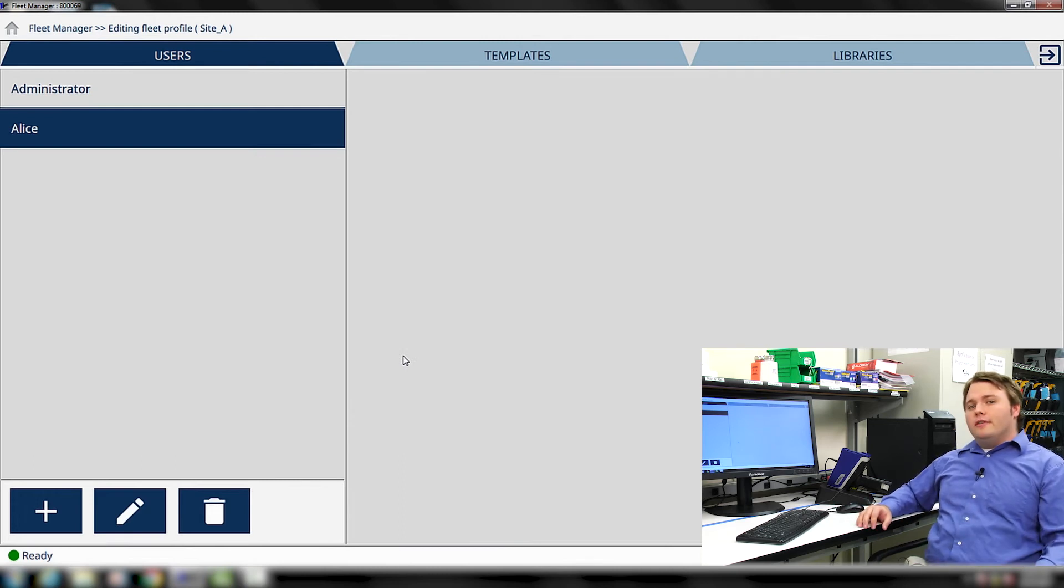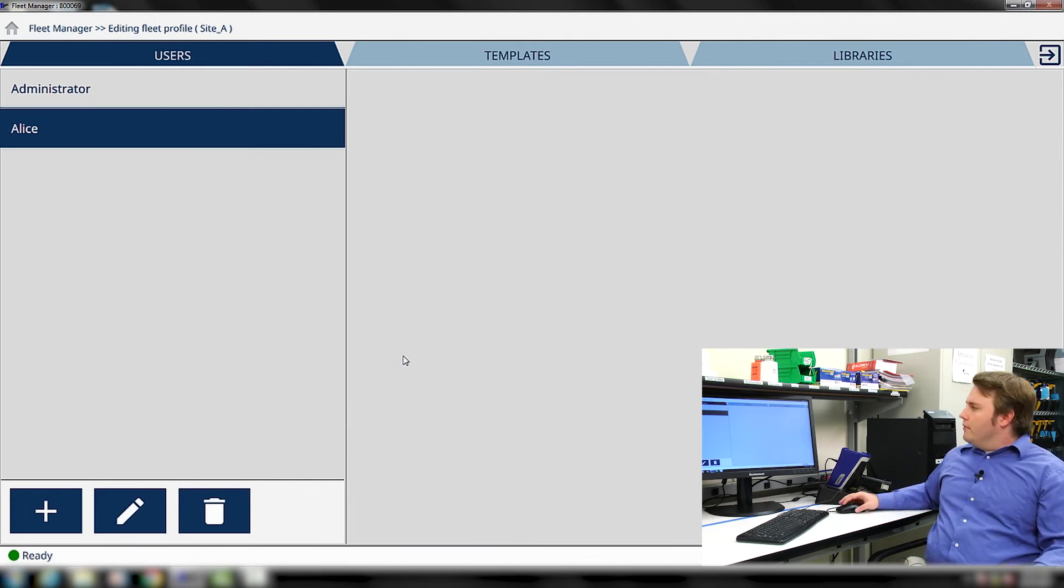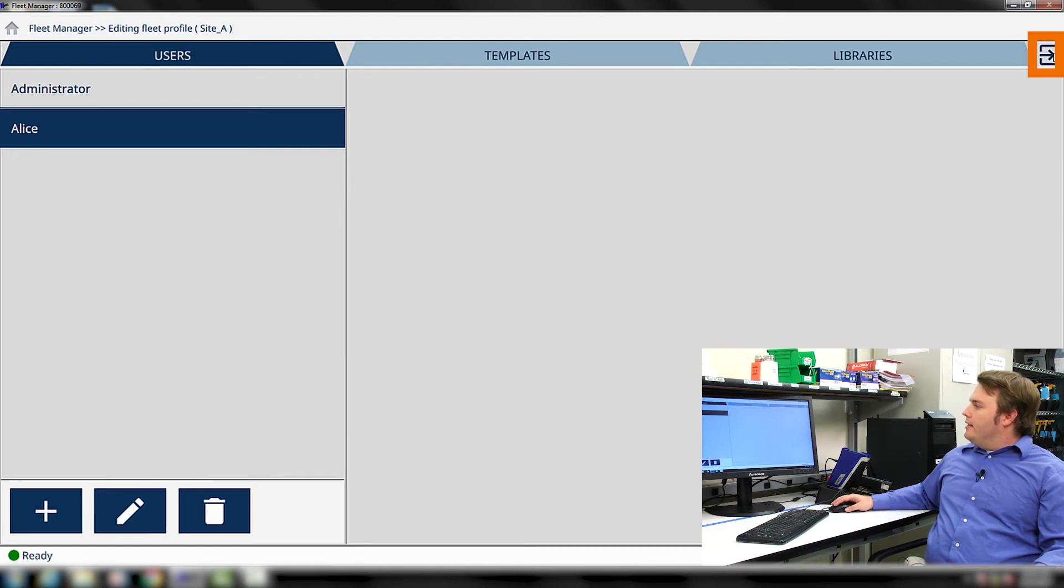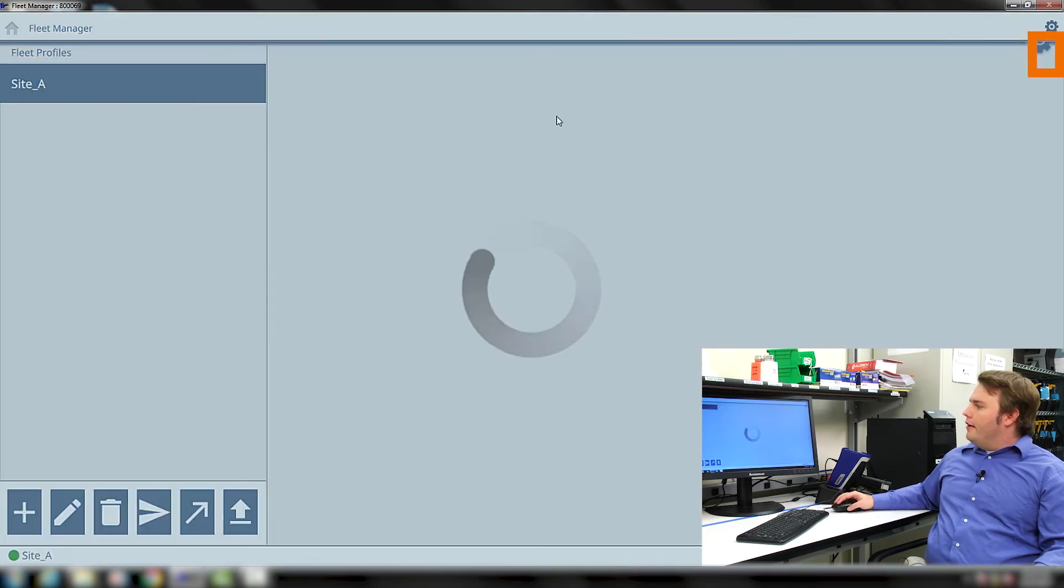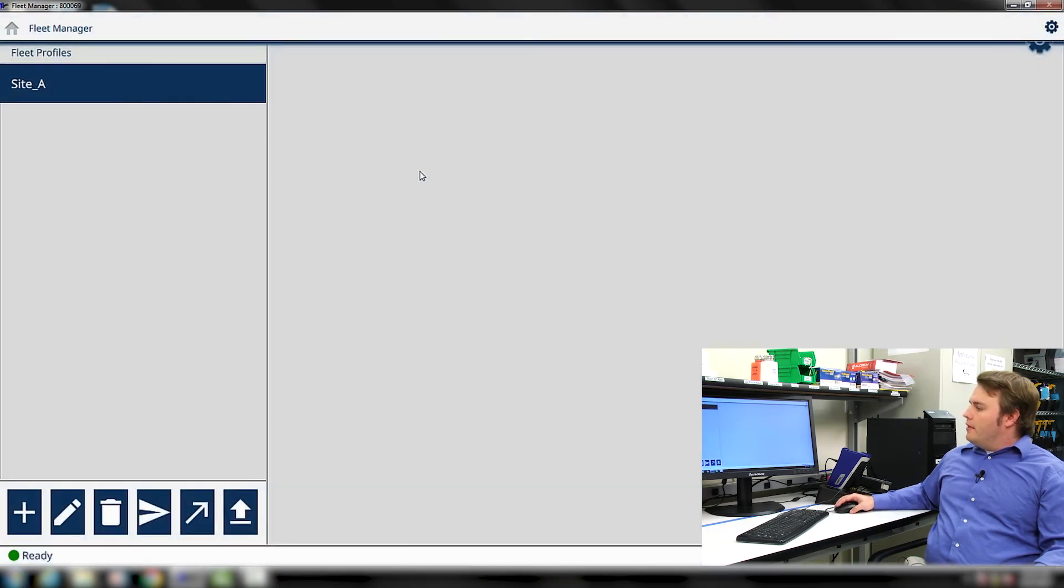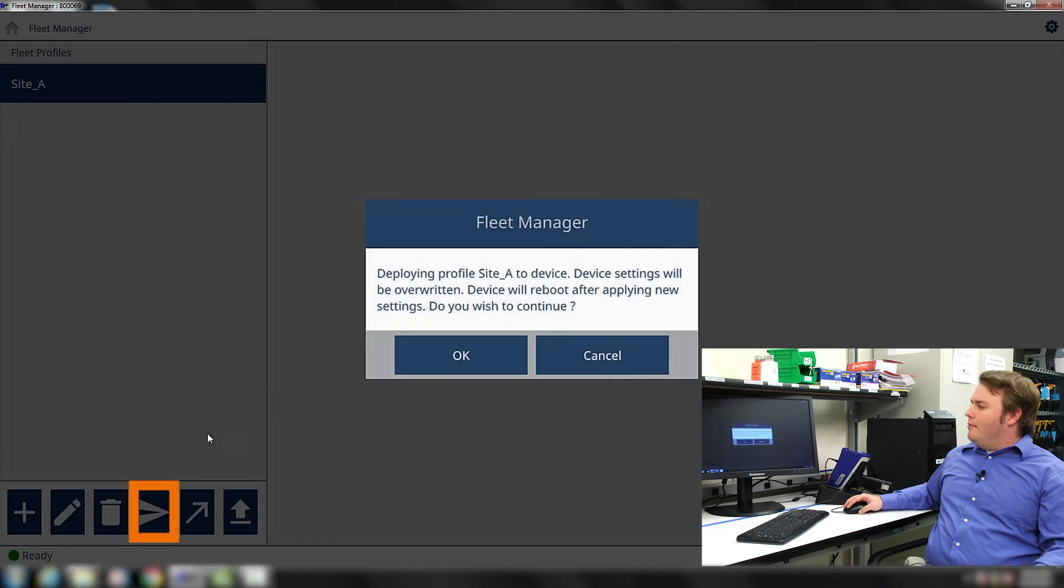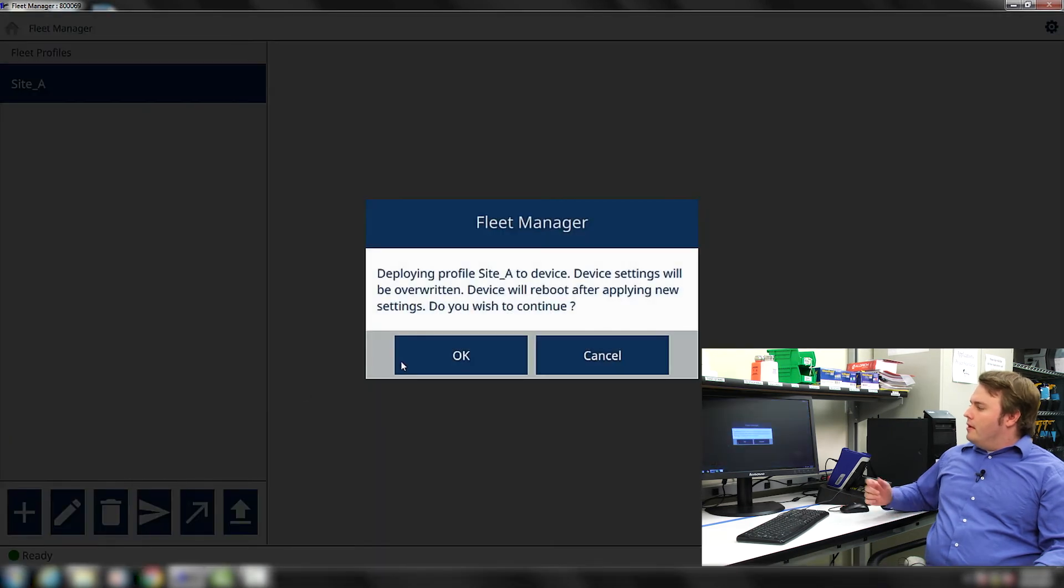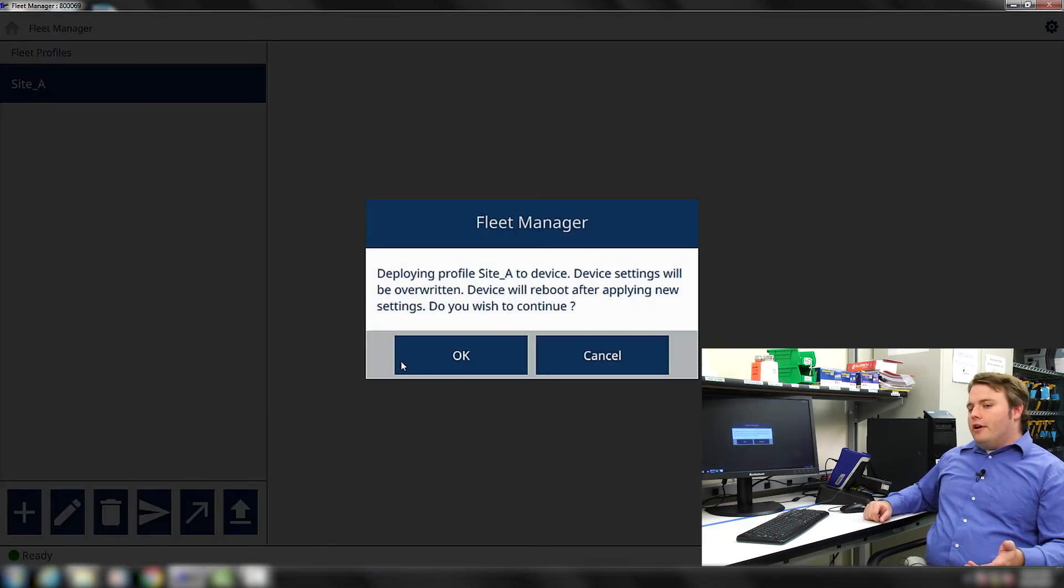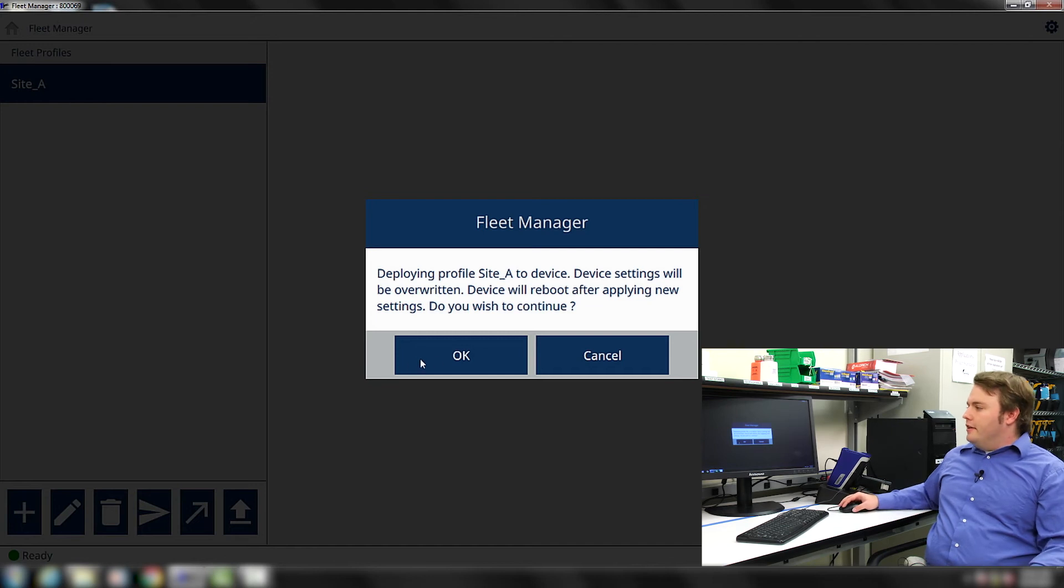We're now ready to deploy this user onto the instrument. We can do that by exiting out of the Fleet Profile. Next, we press the Deploy icon on the bottom. This lets you know that you're going to have to overwrite the previous settings on the instrument.